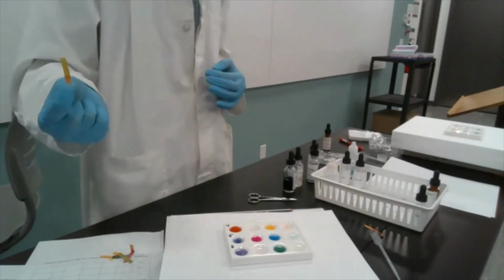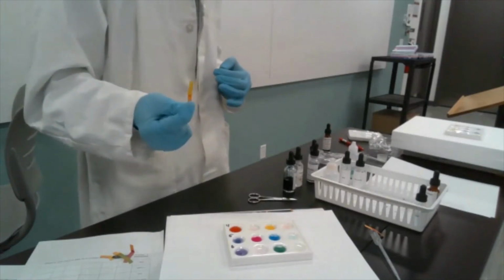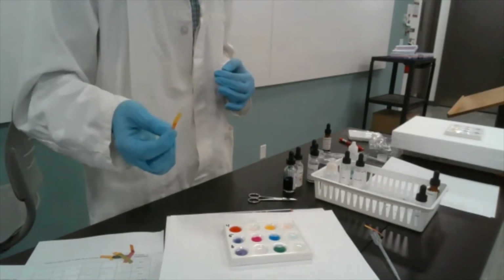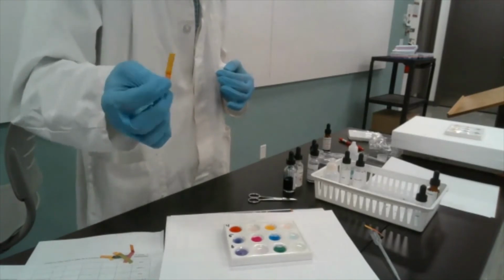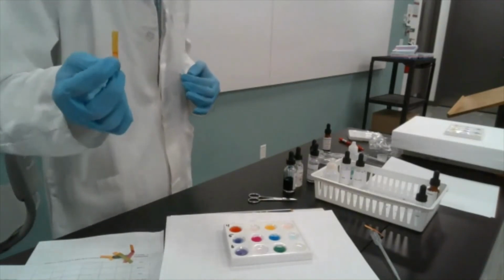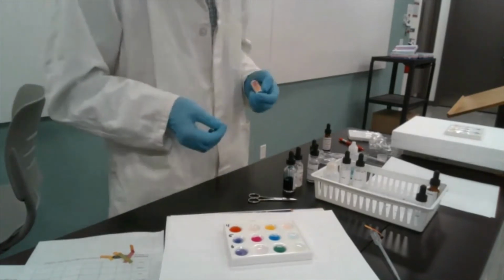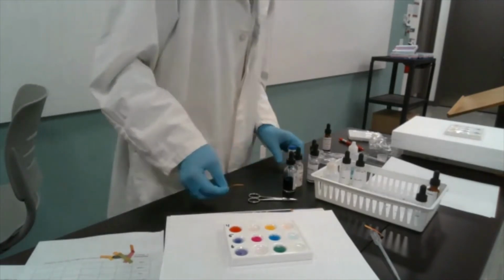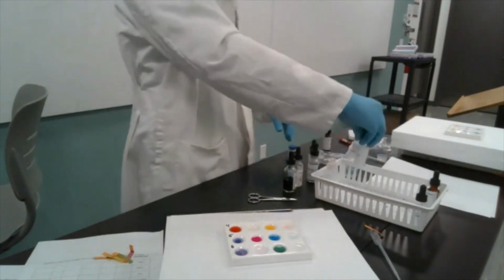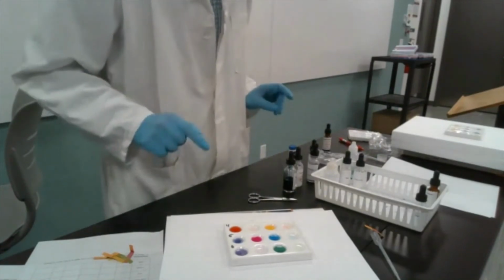So actually, if you test your soap solution with the pH strip, as we've done right now, your soap, your typical soap, is not that aggressive of a substance. Modern soaps are formulated so that they are very gentle on the skin, and that gentleness comes partly from the fact that it's not a strong base or a strong acid. It's almost neutral. So that's something new, maybe for some of you, at least those who thought that soap is a strongly basic or strongly acidic substance.